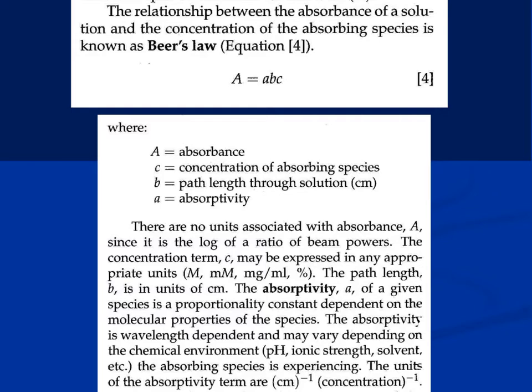This is where we were last time, when we discussed absorptivity. We were talking about how certain molecules can absorb more light and some other molecules absorb less light, so you may need different concentrations to bring them to the same level of absorbance when you are running the methods you are using.